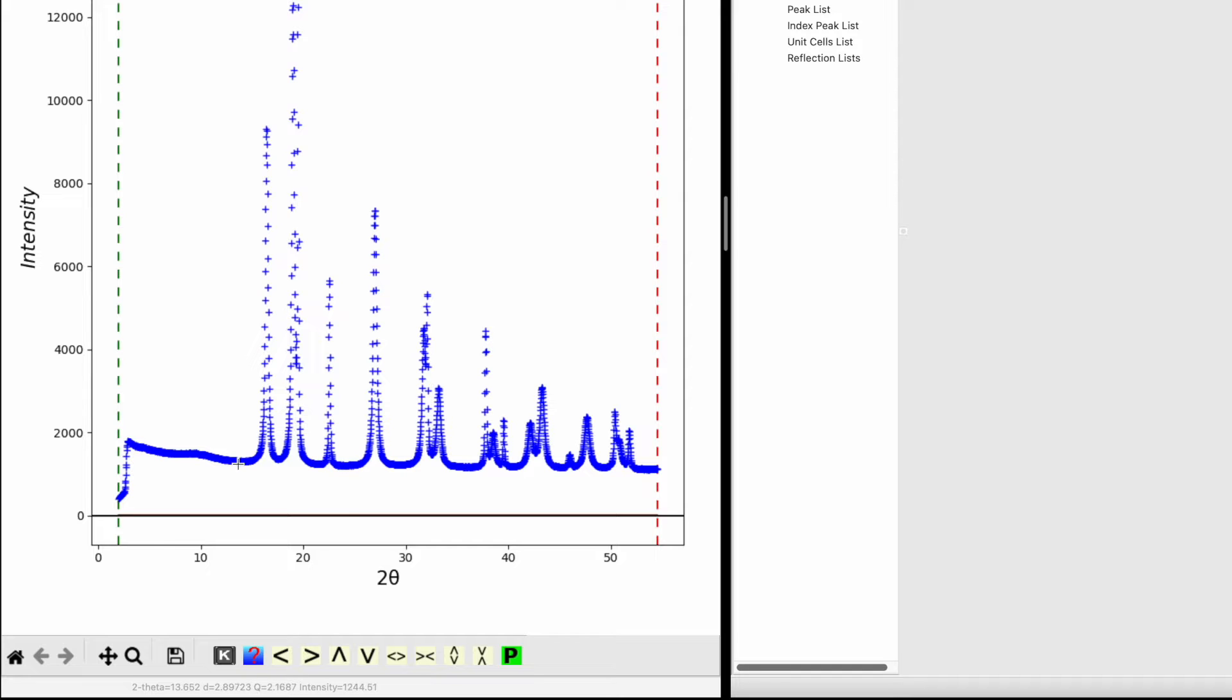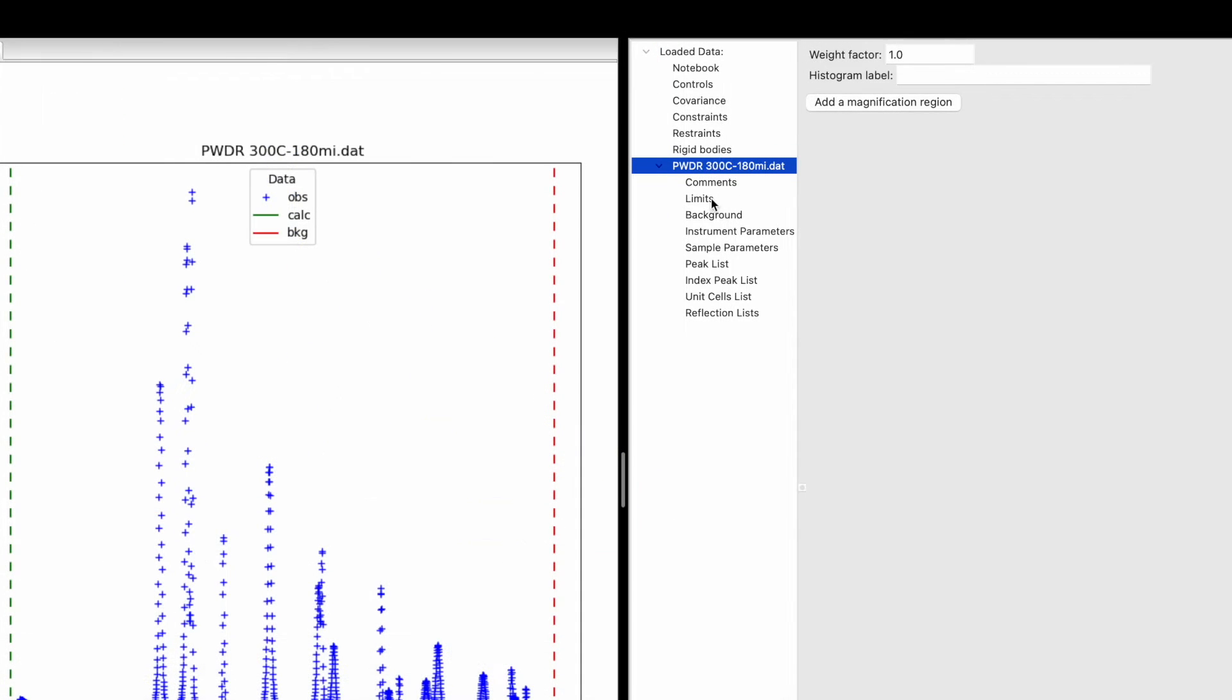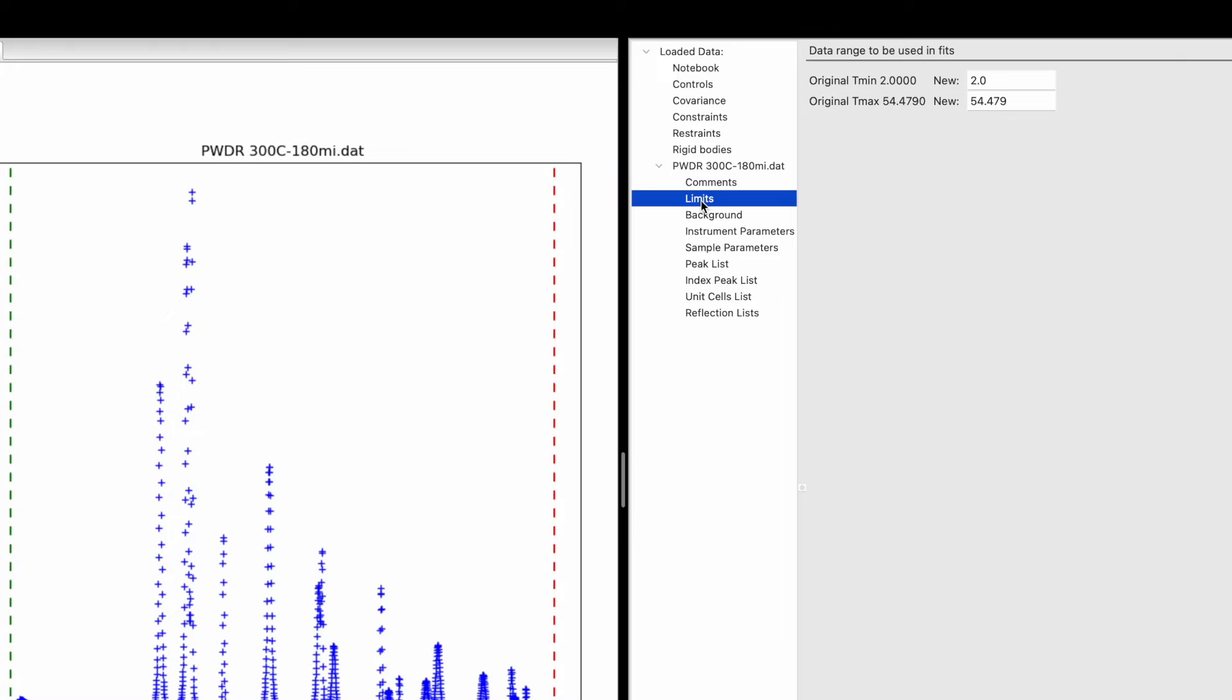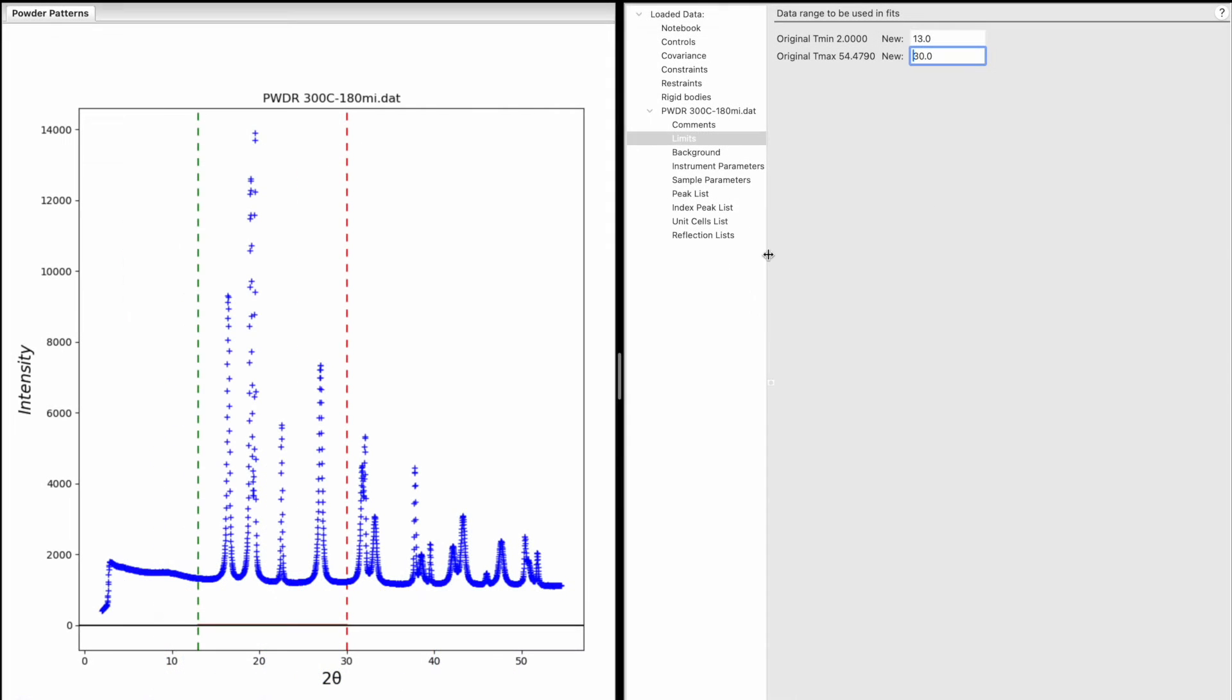To limit the 2-theta range, go to the right-hand side and click on Limit. Set the new 2-theta minima to 13 and maxima to 30. This defines the range for the refinement.